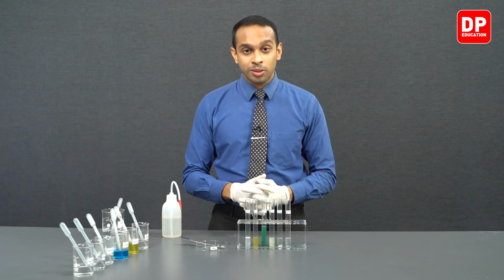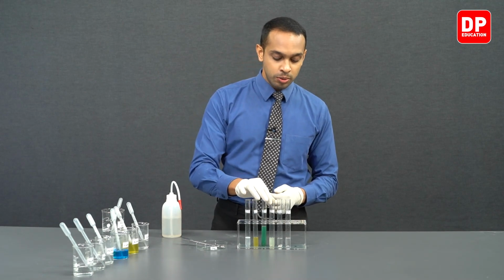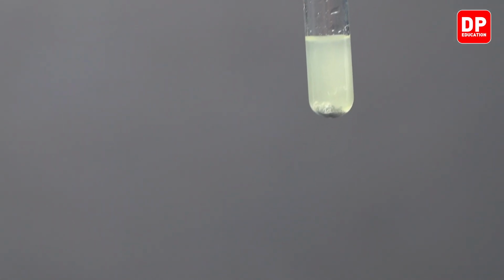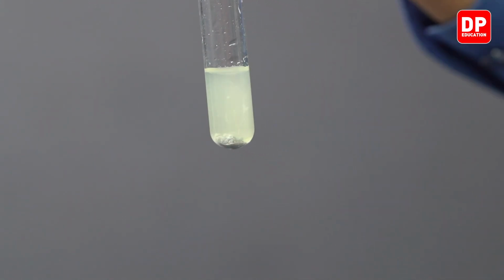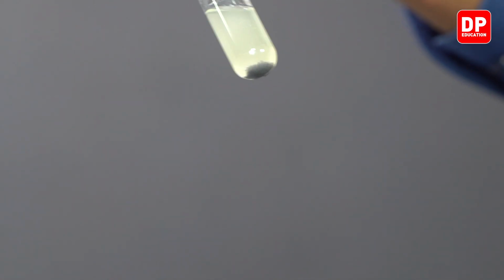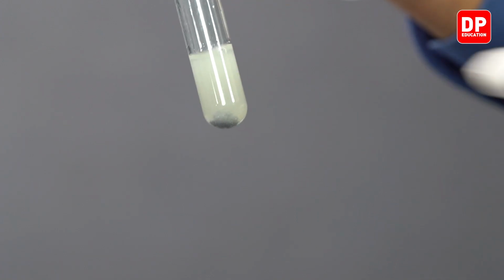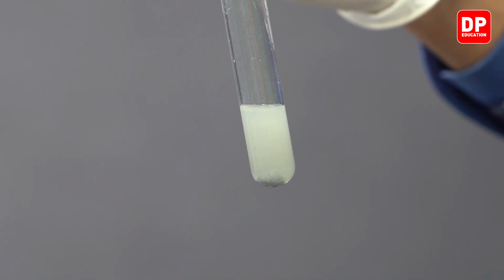Now students, we move on to the fourth test tube here. So in this fourth test tube, we had lead 2+ ions. What do you observe? Has a reaction happened? By the looks of it, yes, a reaction has taken place. We can see that at the bottom of this test tube, a whole blob of lead has been formed, and tiny particles of lead metal are dispersed in the aqueous medium here.